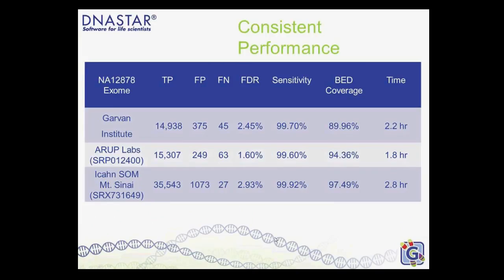And again, I'm going through this quickly because this isn't quite the group of people interested in exomes, but it is reproducible across 3 different exome data sets where our sensitivity is well over 99%. That same algorithm, though, is used in the other workflows. So the advantage here is that you know that at its core, our aligner is going to produce accurate results even in non-model organisms. You can refer back to this kind of an accuracy white paper and comparison to have confidence that the software is in fact putting things together accurately.